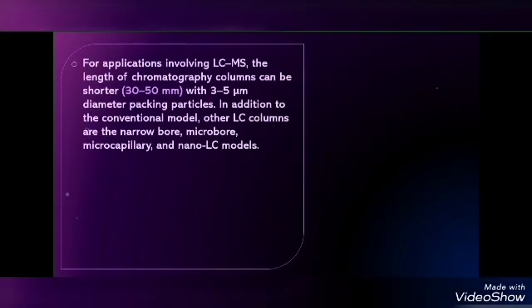For applications involving LC-MS, the length of chromatography columns can be shorter, 30 to 50 millimeters, with 3 to 5 micrometer diameter packing particles. In addition to the conventional model, other LC columns are the narrow bore, microbore, microcapillary, and nano LC models.